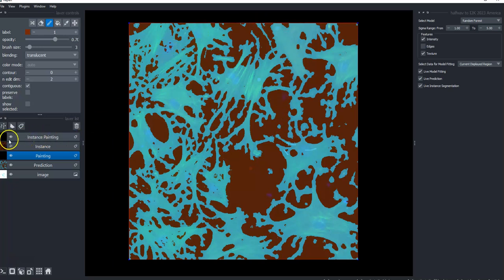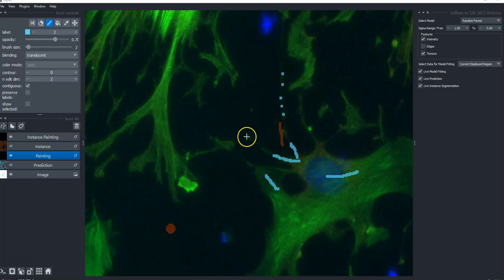I think what I'm going to do is turn the video off while I label some of the small subtle areas. So you can see I'm labeling some of these subtle areas, but you can see the great thing about machine learning pixel-based is for these really fine areas, you don't have to draw the whole filament, which can sometimes be tricky. You can just do individual pixels. So you can sometimes get the fine labels a little more accurately, because again, you don't need the whole thing. You just need individual pixels.